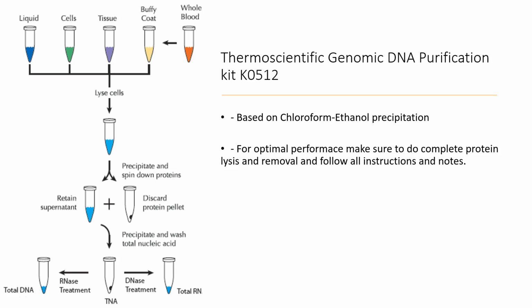Now, when you precipitate the nucleic acids, you can technically get both DNA and RNA out from the same cell. To make sure that you're only getting the DNA fraction or the RNA fraction, we can selectively treat our precipitated product with either DNase or RNase so that we just get DNA or RNA precipitated out as needed.